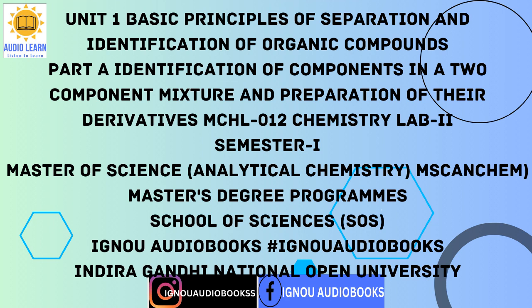3. Aldehydes and ketones. 1. 2,4-dinitrophenylhydrazine. Aldehydes and ketones both give 2,4-dinitrophenylhydrazone derivatives on reaction with 2,4-dinitrophenylhydrazine. 1. Dissolve 0.5 g of aldehyde or ketone in 1 ml of ethanol taken in a test tube. 2. Add 3 cubic centimeters of the 2,4-dinitrophenylhydrazine reagent. 3. Heat the contents on a water bath for about 10 to 15 minutes. 4. Let it cool so that an orange-red solid separates out. 5. Filter the solid so obtained and wash it with aqueous methanol. 6. Recrystallize the solid from ethanol or ethyl acetate.